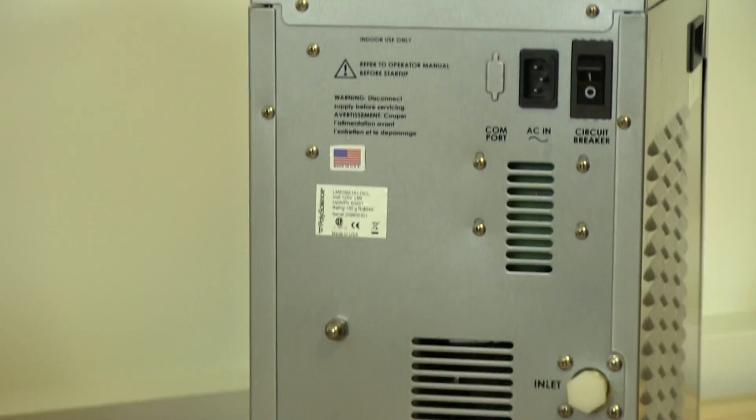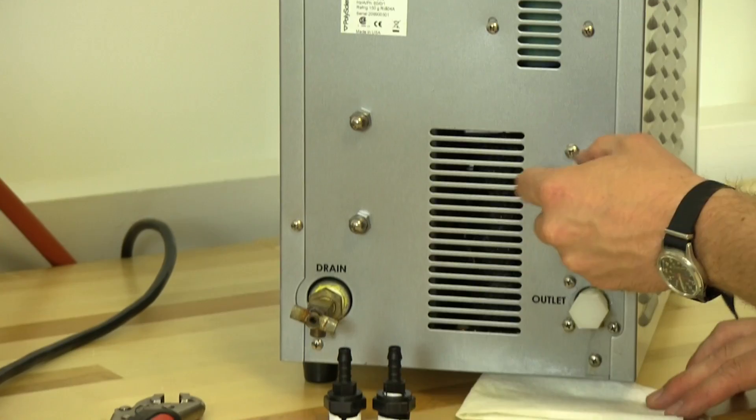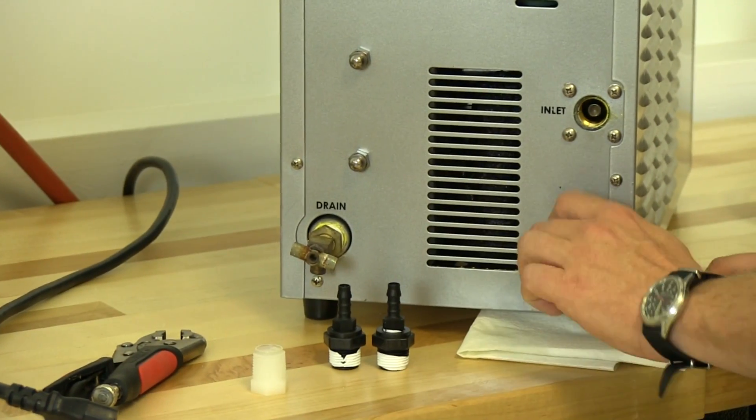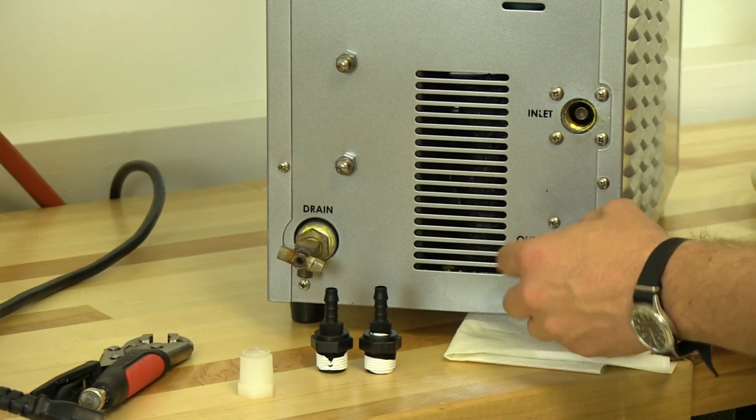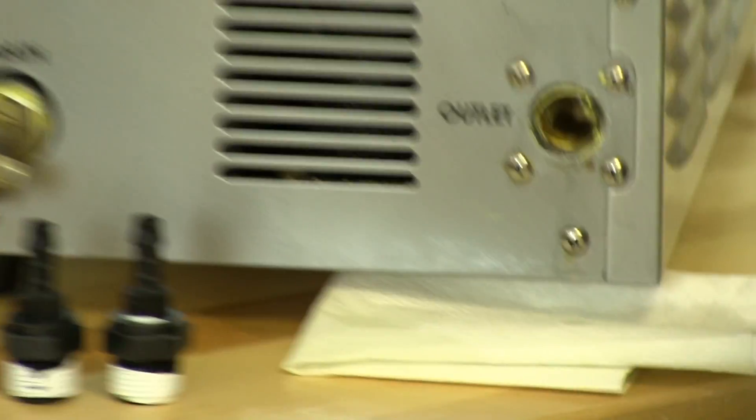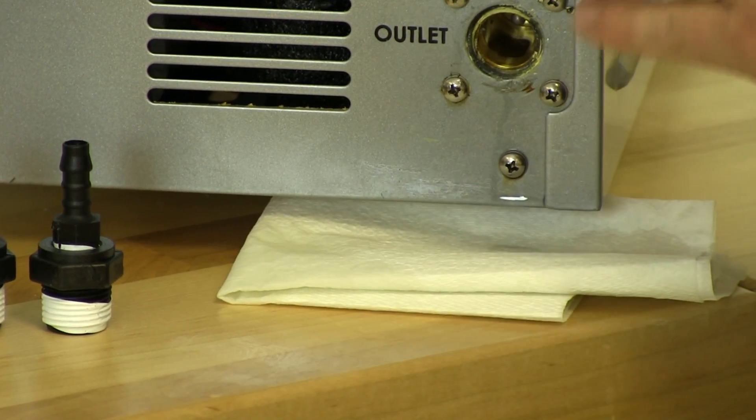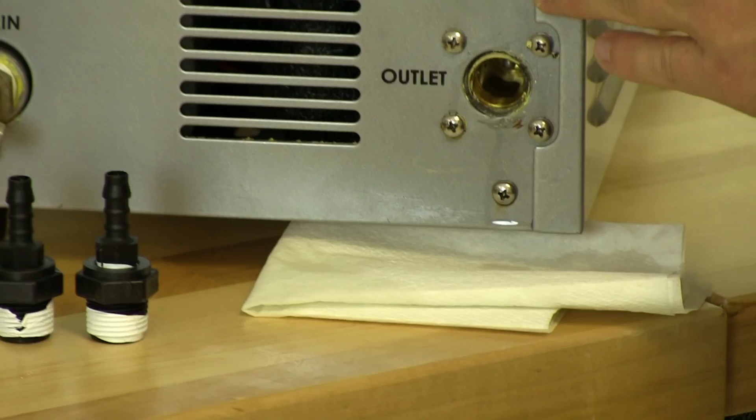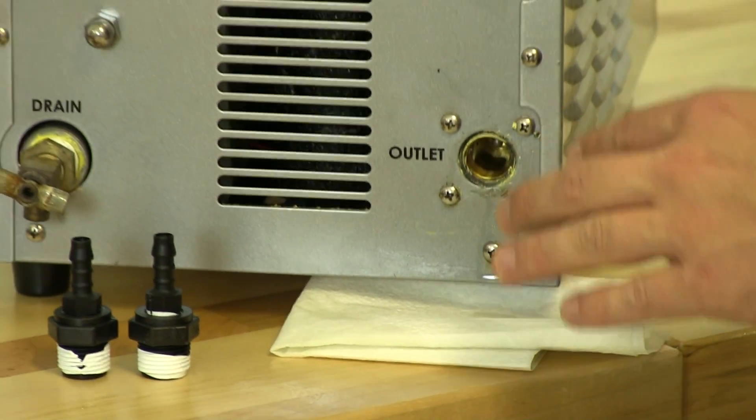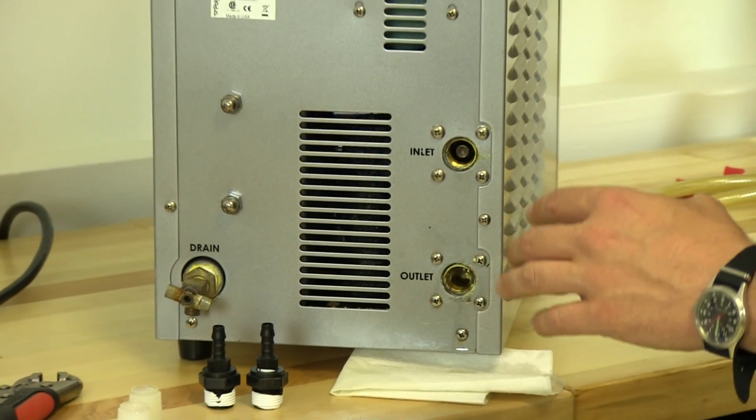I have a paper towel because when we remove these inlet and outlet plugs, nothing will come out of the inlet, but occasionally a small amount of propylene glycol mix will come out of the outlet. This is actually on purpose. They are tested in the factory, and before they ship, we drain them but leave a small amount in there to protect them during shipping.